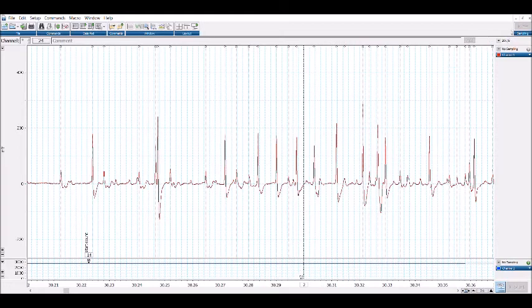So up here in the corner, you can see it has the time elapsed. And then this bottom one shows the number of spikes. And as mentioned previously, it's a little inaccurate. So you're just going to go through it, and this is just a demo of how you do it to count the spikes. And this is where the key counter comes in.